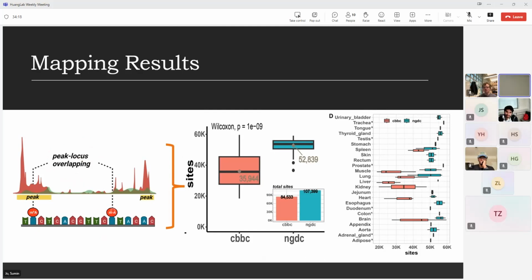Some sites have no overlapped peaks versus some sites have overlapped peaks. By overlaying the m6A peaks from normal tissue conditions and the selected high confidence sites across 28 different experimental conditions or 24 different cell lines, we were able to refine the high confidence m6A sites that exist in the normal tissue conditions together.